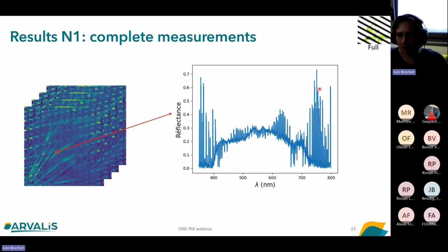So there is a lot of aberration. The dark current isn't corrected here, but the idea was to judge the middle value, between 400 and 700. Also, this process wasn't the main purpose of my internship.